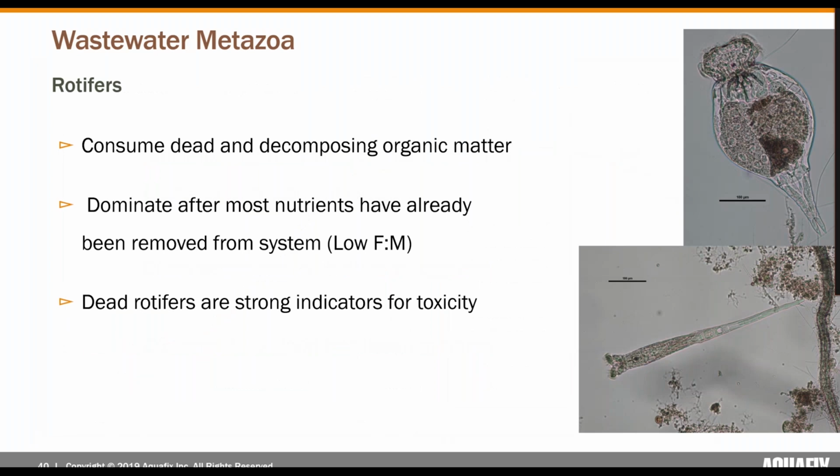So starting off, we can discuss the broad characterization and grouping that is defined as rotifers. Rotifers are really interesting because they come in many different shapes and sizes, but they commonly share a mastax, a jaw structure, and some other general characteristics that make them identifiable as a general rotifer. Rotifers are often observed with cilia structures that are used to funnel and filter feed dead and decomposing matter from the bulk liquid. And that's whether that dead or decomposing matter is algae, bacteria, or protozoa.